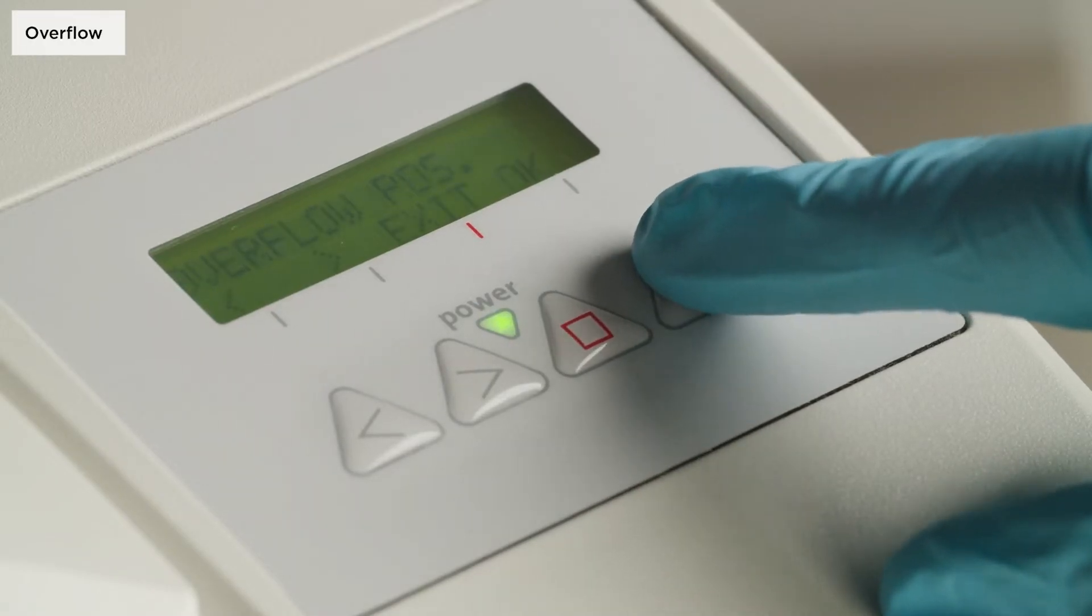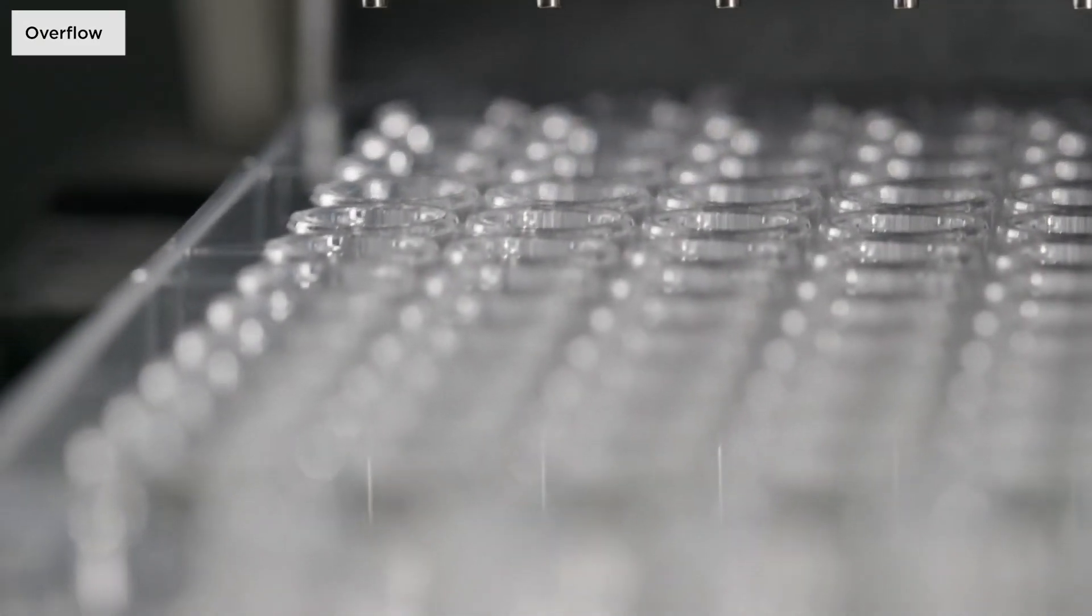The overflow position in a wash step is selected to generate a circular flow in the well and is recommended for ELISAs.